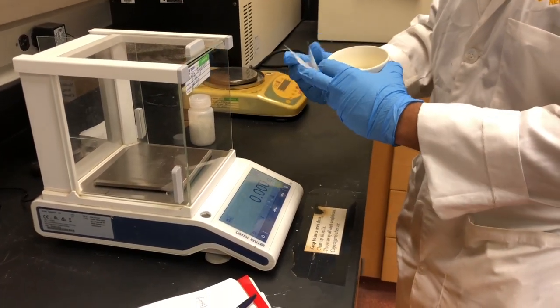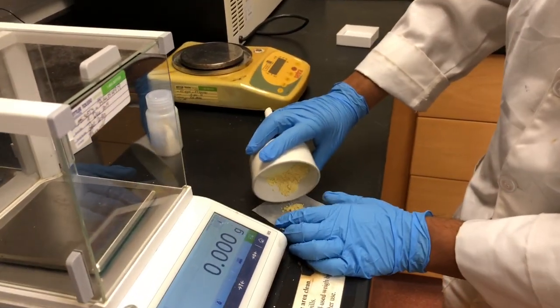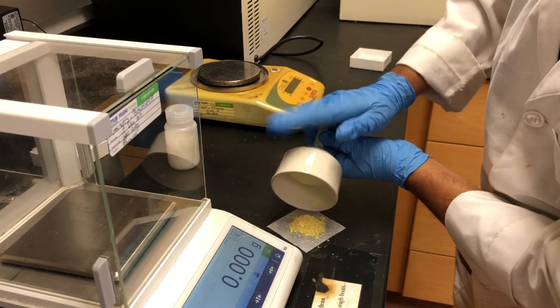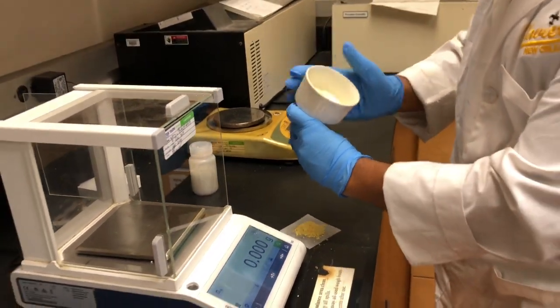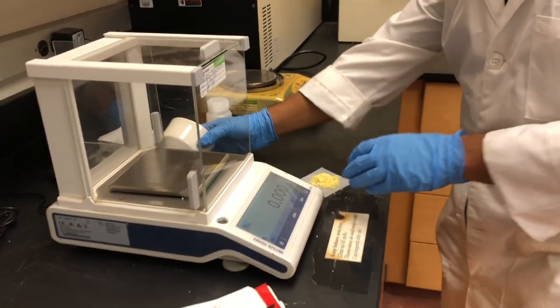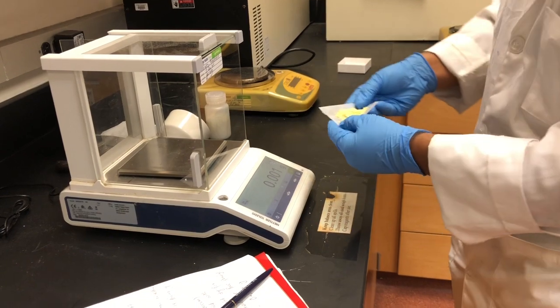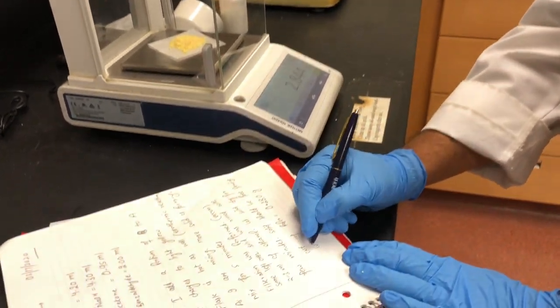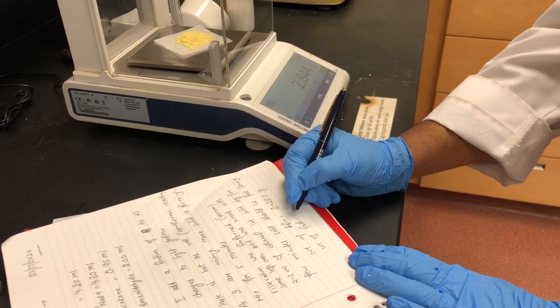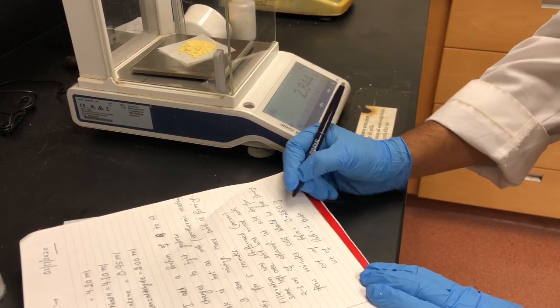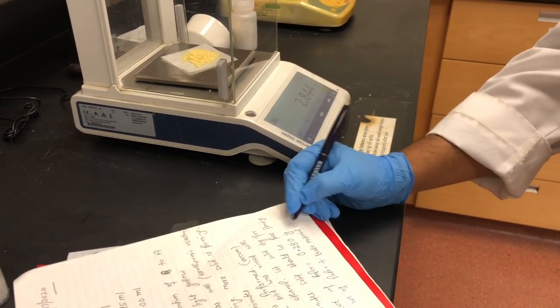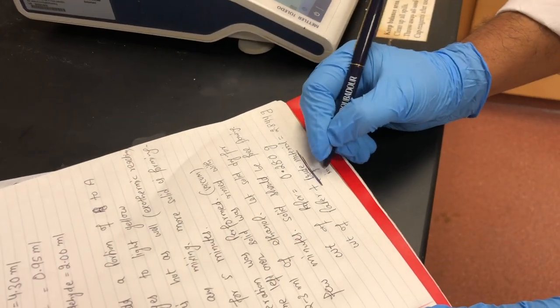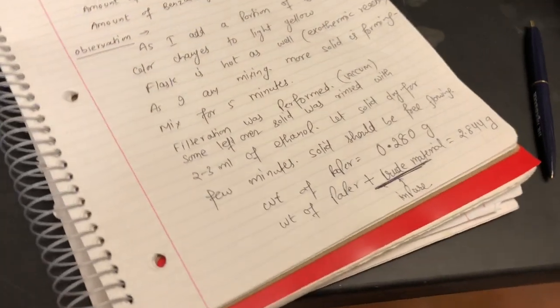Then I am going to transfer, I am folding the paper to make sure and I will transfer most of the solid as much as I can take it out. I am tapping it slowly to make sure and then I am going to check the weight again. And you can see that it is 2.845 gram of product along with weight of paper. So, I can subtract the weight of paper and that will be the weight of my crude product.